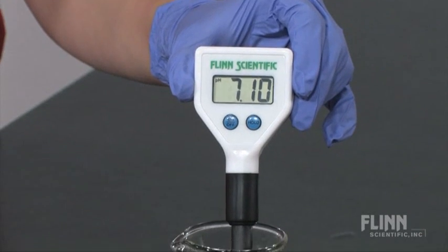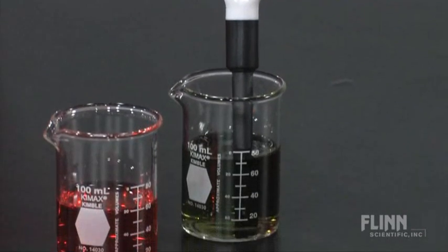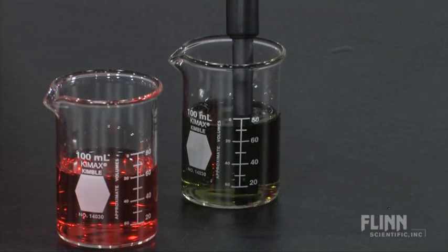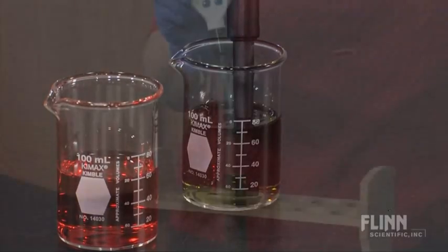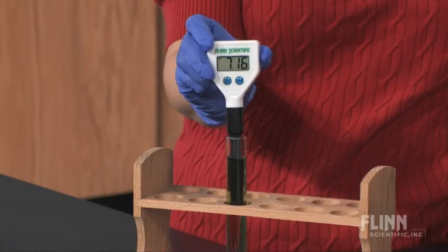Additional features include convenient one-point calibration, a rugged electrode, and a versatile slim design that will easily fit into small beakers, vials, and even test tubes.